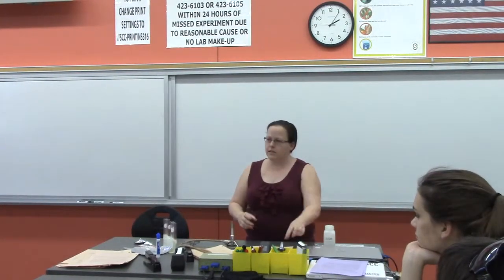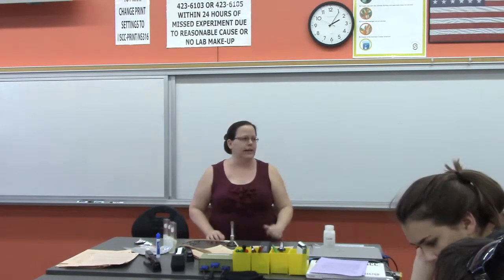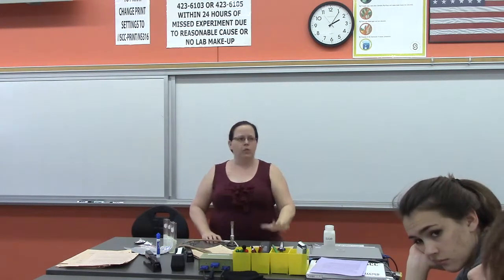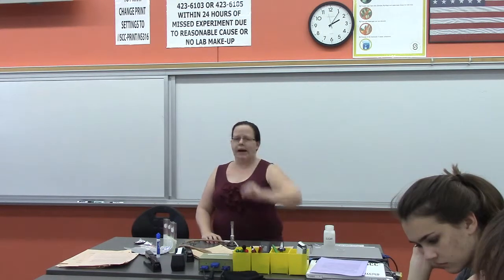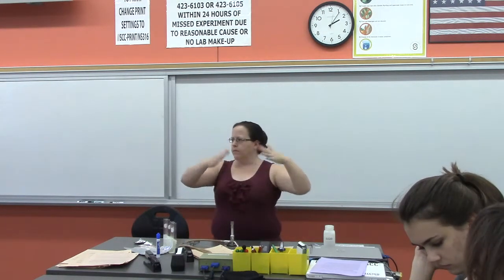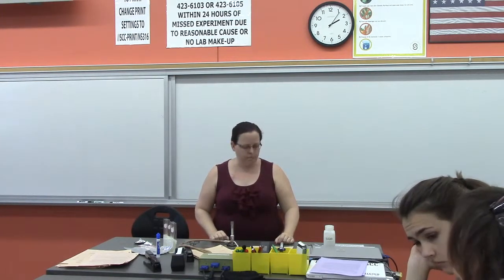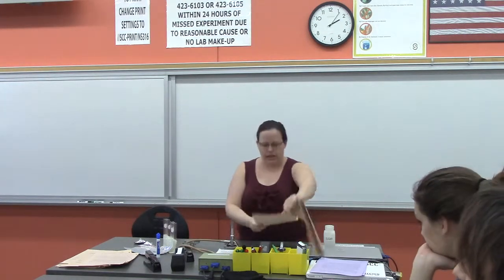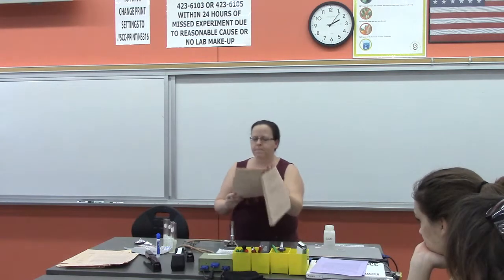The last part of this lab is not actually an experiment that you're going to do. It's a demonstration that I'm going to do. It's going to be in the back of the fume hood back there. Again, when your group gets to that point, and you're ready for the iodine, I'll go back and walk you through the demo that's back there. Okay? So we should space out naturally so that not everybody is getting to the iodine at the same time. We've got questions for each. At the end, we've got some questions on physical and chemical properties, distinguishing those kinds of things.